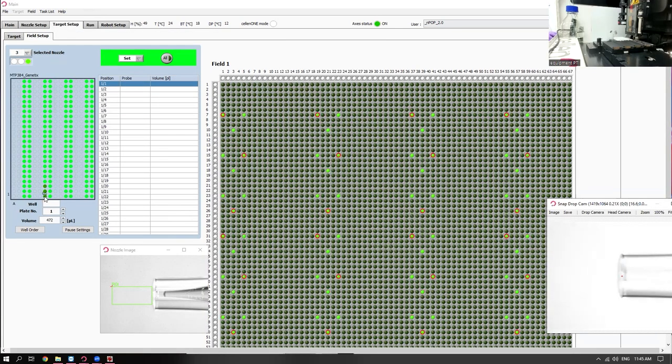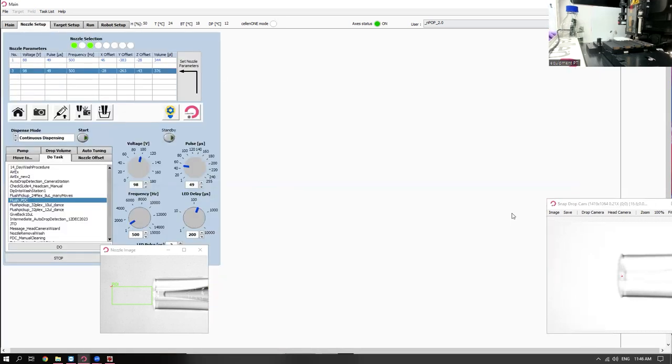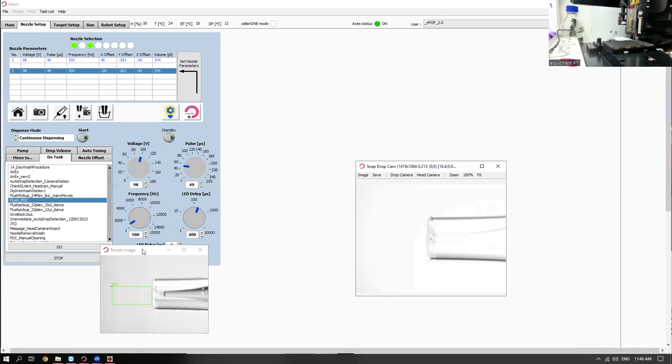So we see that the position of these spots, like which of these labels, is different in each cluster, which allows us to then vary which of the cell samples are getting which label. You have a nice bit of variety there to avoid label-specific effects.